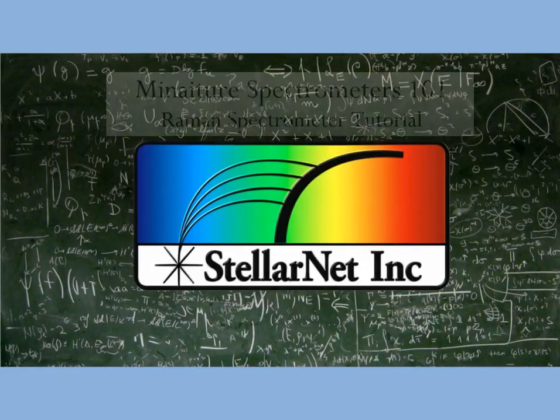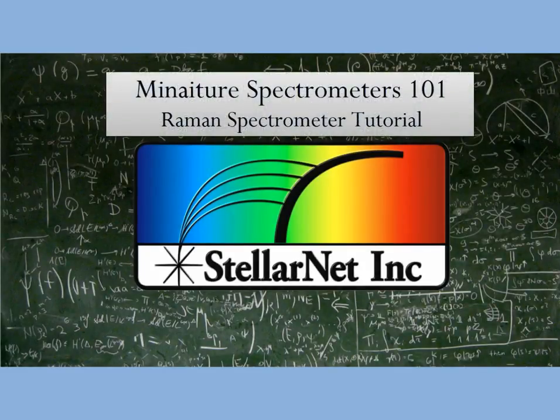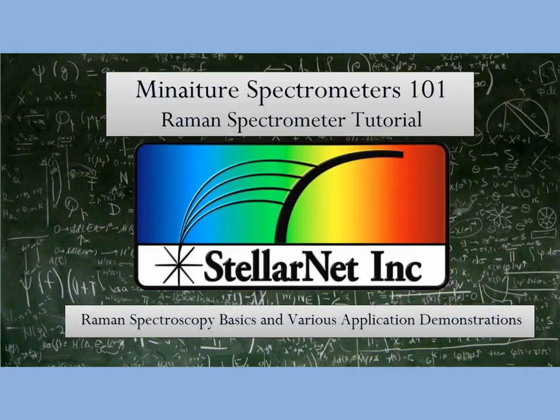Hi, and welcome to Miniature Spectrometers 101, the Raman Spectrometer tutorial. Today we will be reviewing Raman Spectroscopy basics and looking at various application demonstrations.